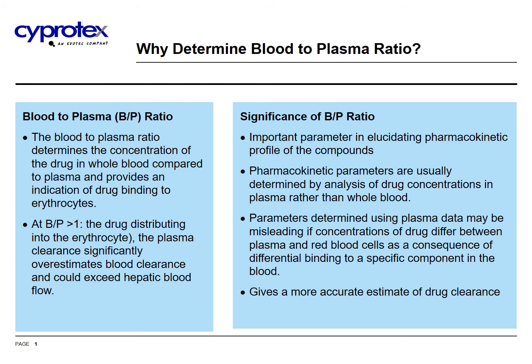Physiologically based pharmacokinetic modeling and simulation have been well established in the pharma industry in recent times. Blood to plasma ratio has been one of the important parameters, along with other ADME and physicochemical properties of the drug, in predicting the pharmacokinetic profile of the drugs.